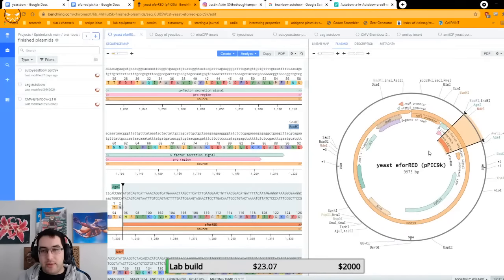So yeah, that's this. Okay, a couple of questions because I'm seeing them go by. The double blue won't, I don't think, mess up the color combinations, at least in white light. But it doesn't glow in white light. So under UV, if you're trying to do a fluorescent color combo thing, it still wouldn't matter because it doesn't glow. It's just protein for all intents and purposes.